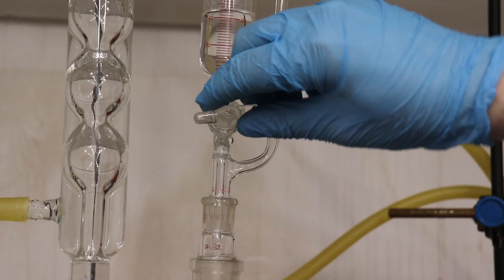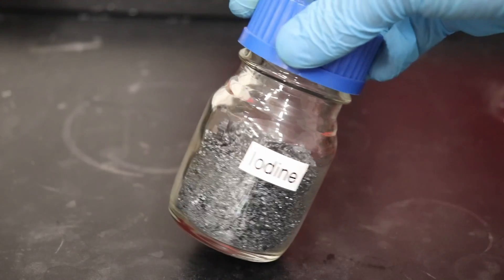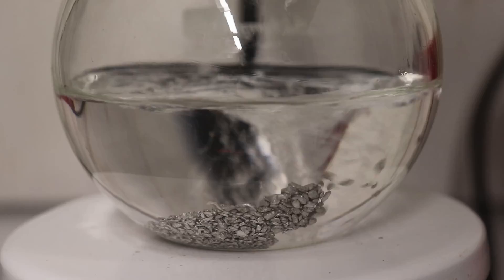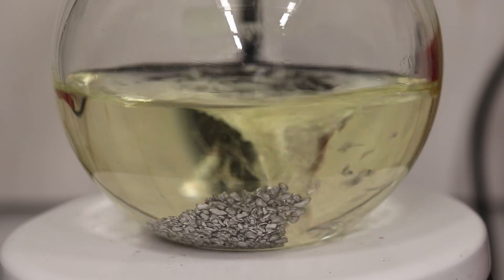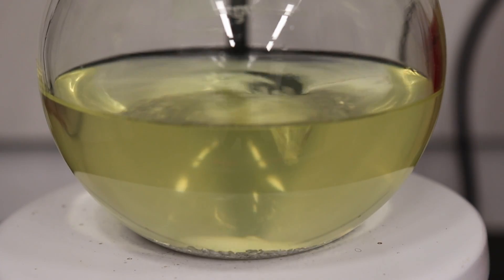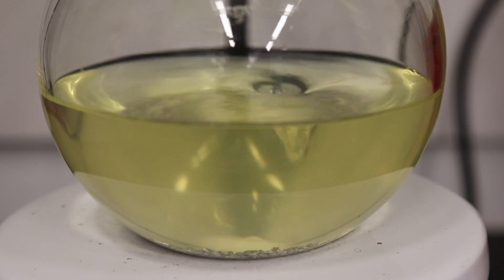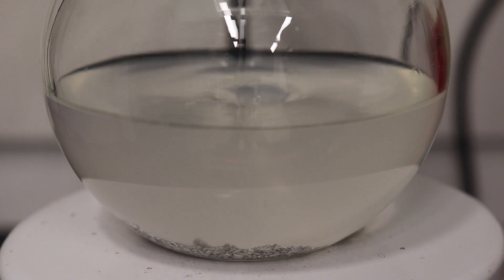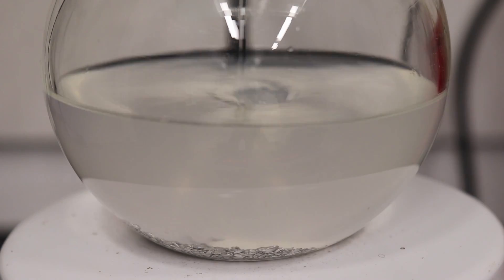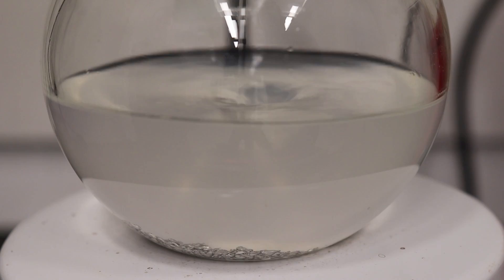The reaction still hasn't started after a few minutes, so I added a single small crystal of iodine down the condenser. The iodine should react with the magnesium oxide coating on the surface of the magnesium, exposing a fresh surface of magnesium metal for the bromobenzene to react at.